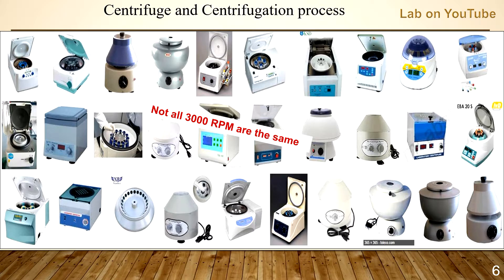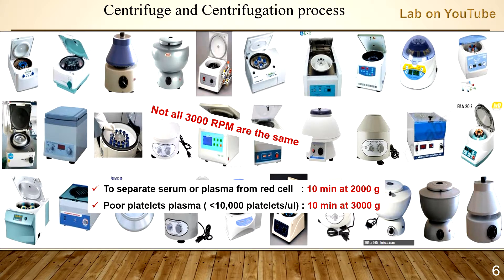That's why we don't depend on RPM in scientific language. To separate serum or plasma from red cells usually requires about 10 minutes at 2000 G. To obtain platelet-poor plasma — less than 10,000 platelets per microliter — it requires 10 minutes at 3000 G.